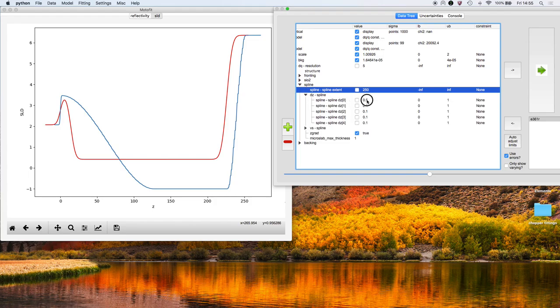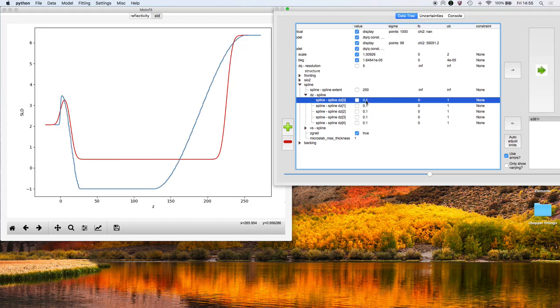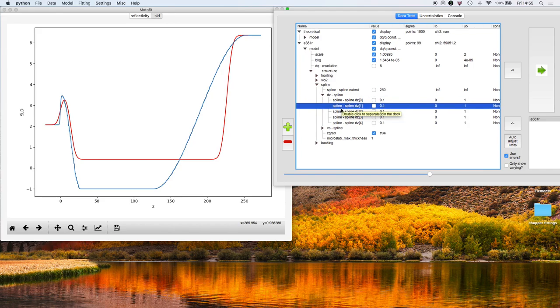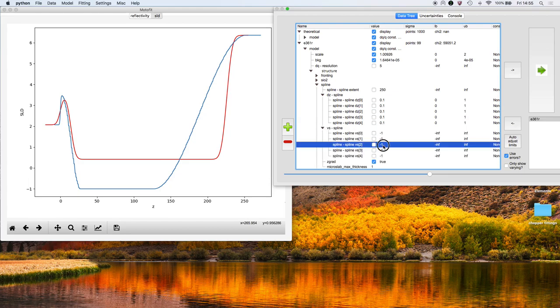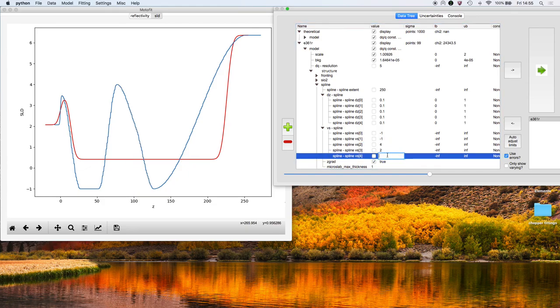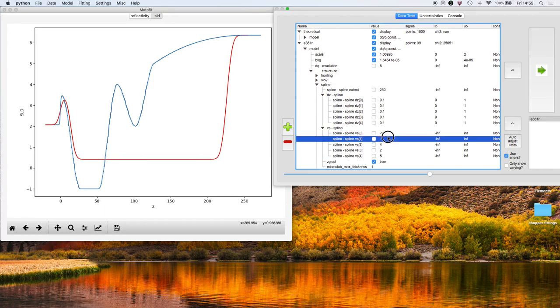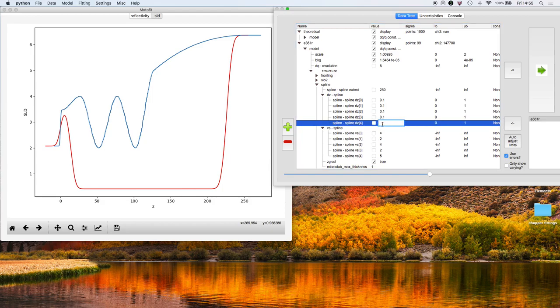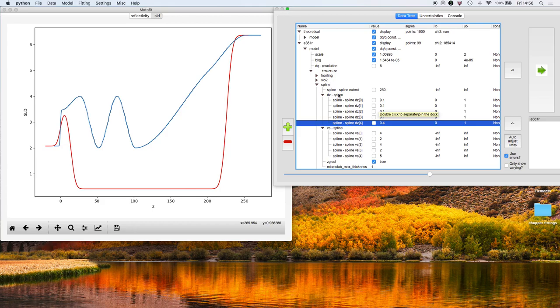As I said, these dzs are the fractional distance from the previous knot. 0.1 for the first one is 25 angstroms through the film. This knot would be 0.2 of the way through the film, this knot 0.3 and so on. You can create all manner of weird and wonderful profiles using these splines. Use the number of knots sparingly, probably the minimum number of knots required to fit the data adequately.